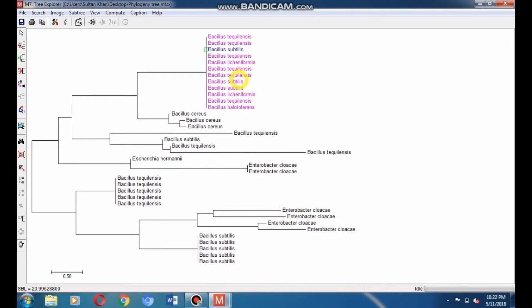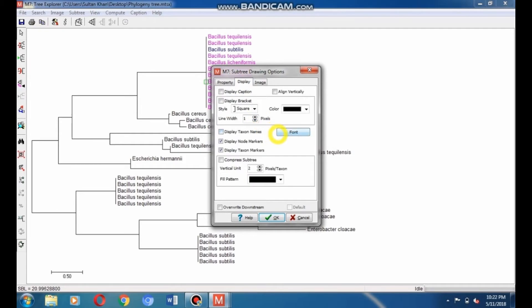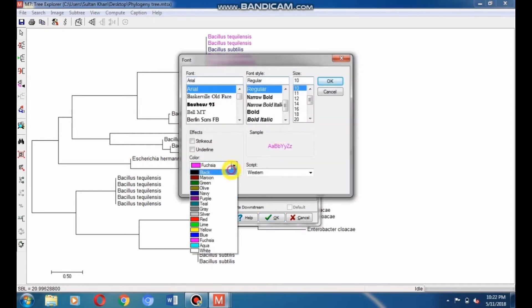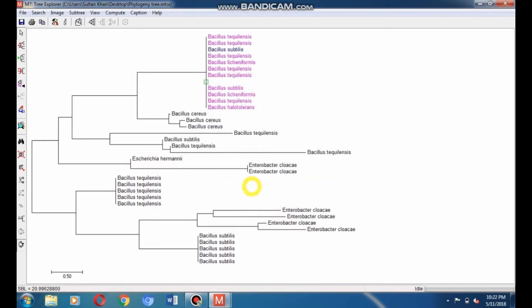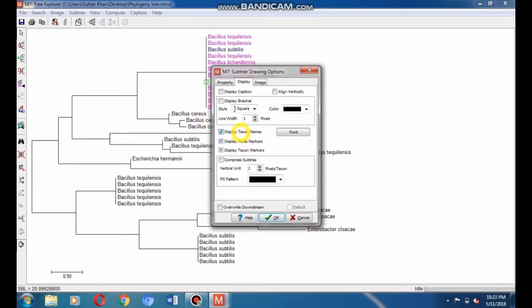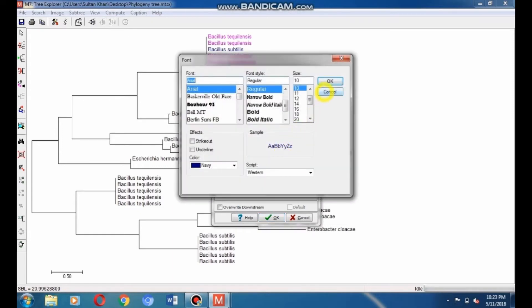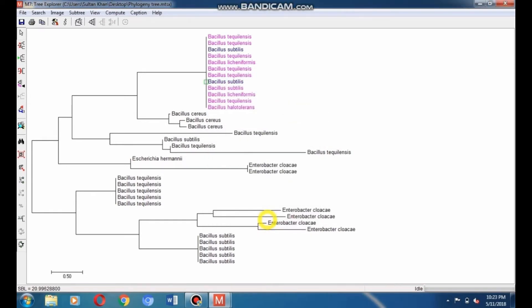Select the other Bacillus satelis species and put the cursor in front of it. Go to subtree drawing option, click on Display, go to Display Taxa Name. Select the Font and give it navy color. Click OK to apply all these changes. Here you can see the navy color taxa of the satelis species.